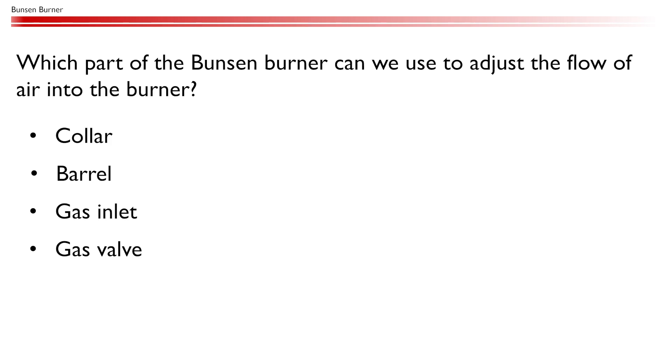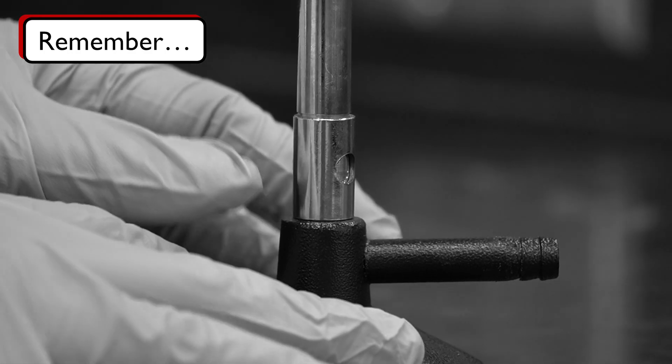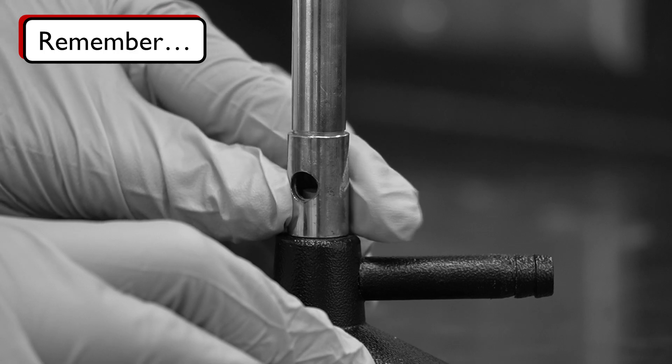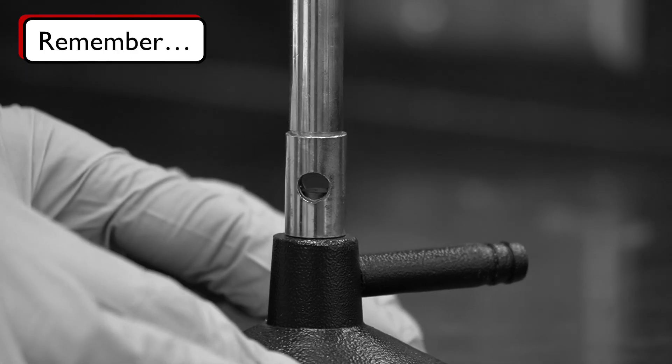Which part of the Bunsen burner can we use to adjust the flow of the air into the burner? As mentioned before, the collar, which is located at the bottom of the barrel, can be adjusted to control the air intake and the temperature of the flame.